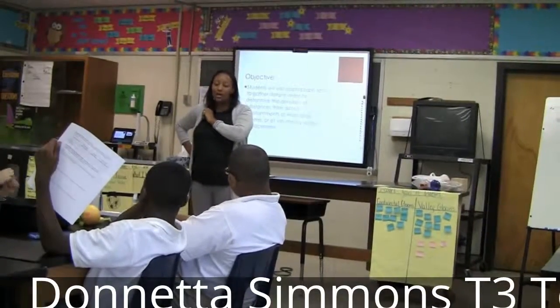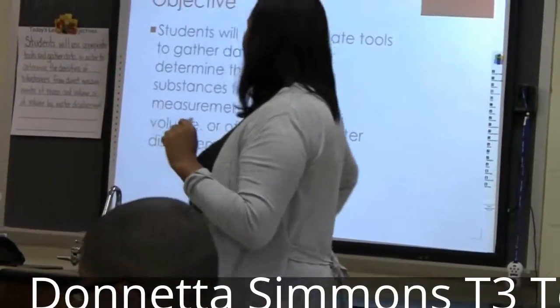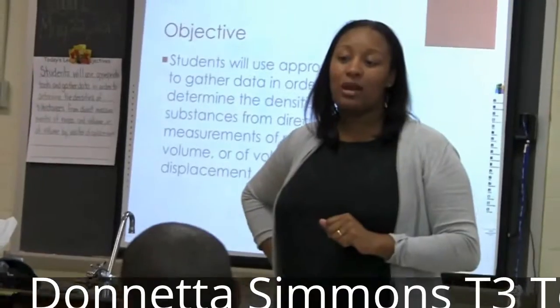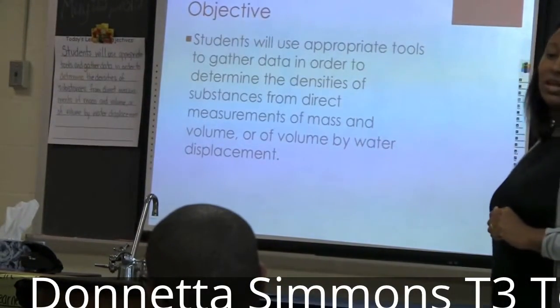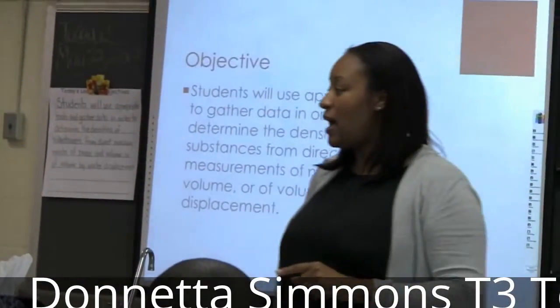Good morning, everybody. Today we're going to work with density. So our objective is that you're going to use the appropriate tools for measuring volume and mass to gather data in order to calculate the densities of certain substances. So in front of you, each of you should have a worksheet.